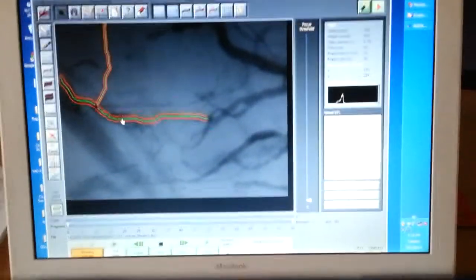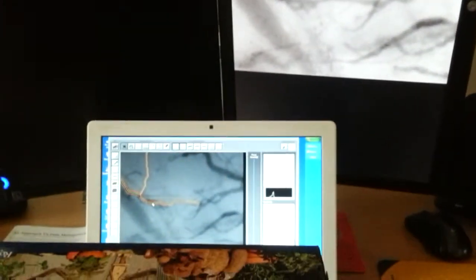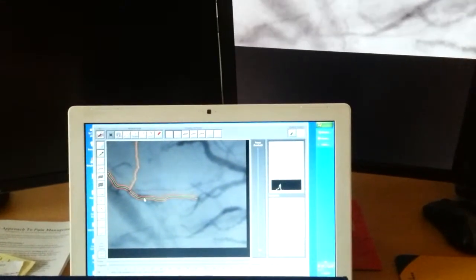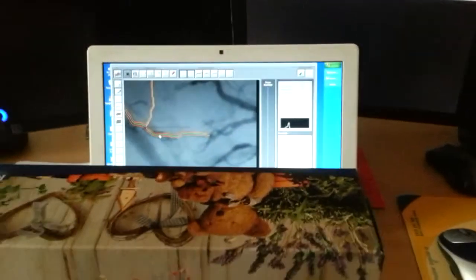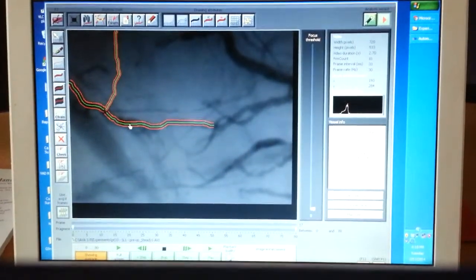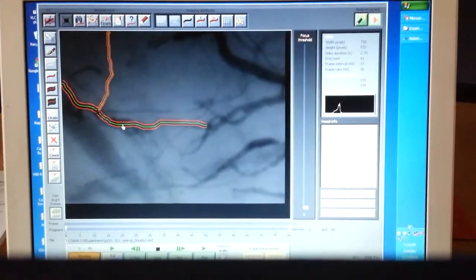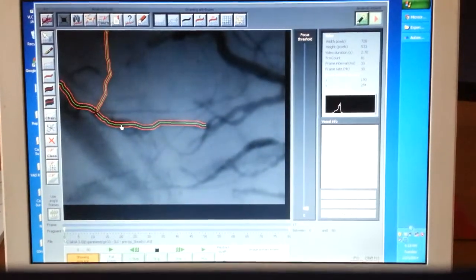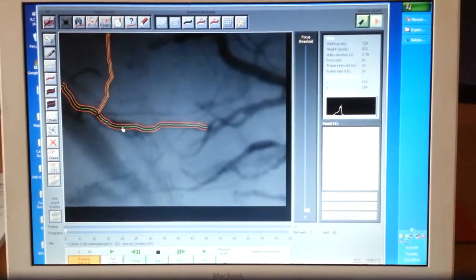So this is what my workstation ends up looking like. You've got the file looping there, and then the AVA file right there. And my Kleenex box is to prop up my camera so I can record this video for you guys. All right, so we'll just continue on here. We'll put my camera back down. Just continuing on, I want to make sure that I'm not losing anything here. Reposition my camera. Okay, perfect.